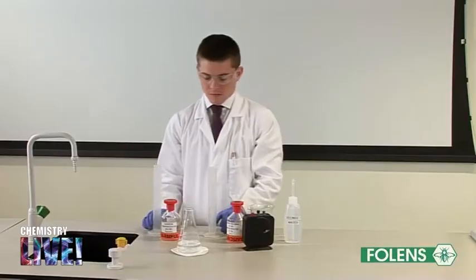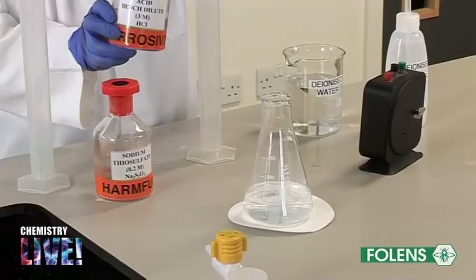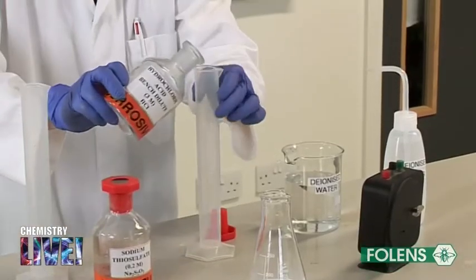Using the other graduated cylinder, pour 10 centimeters cubed of the hydrochloric acid solution into the conical flask.